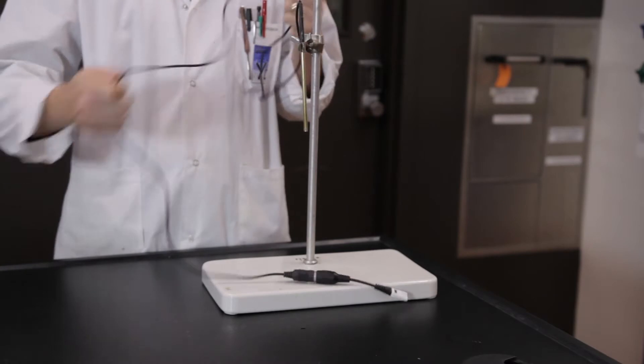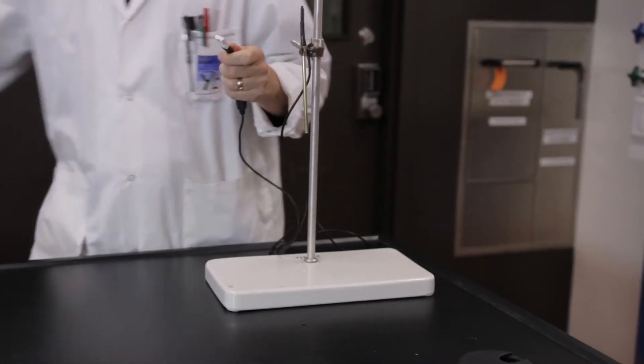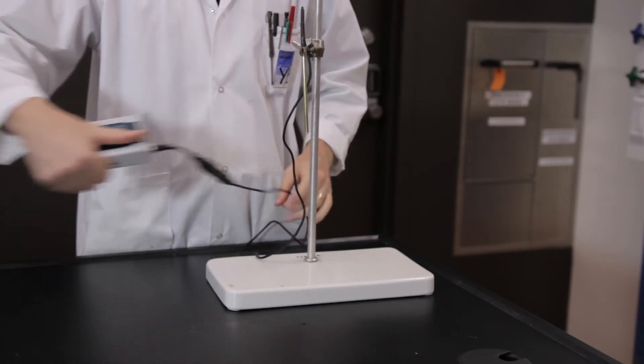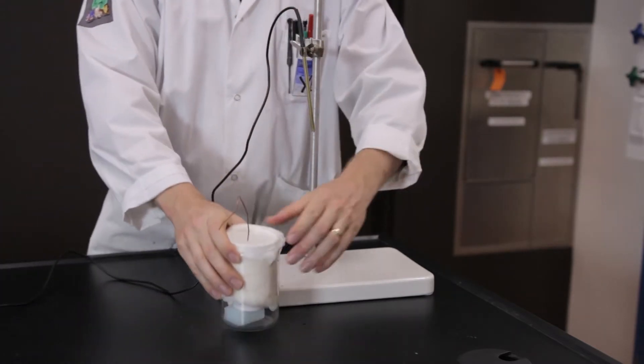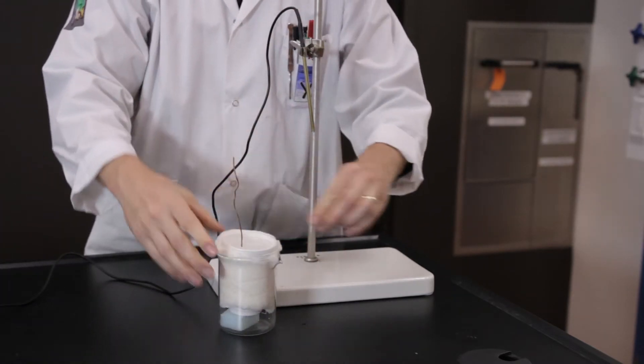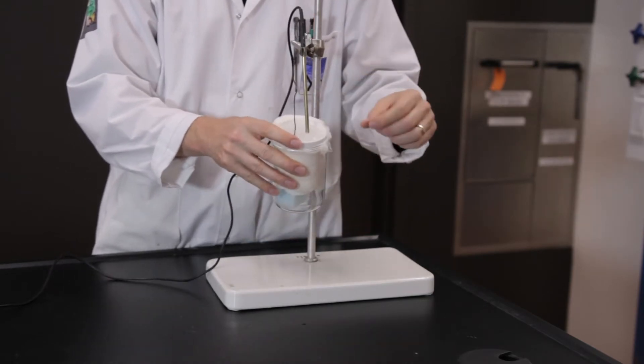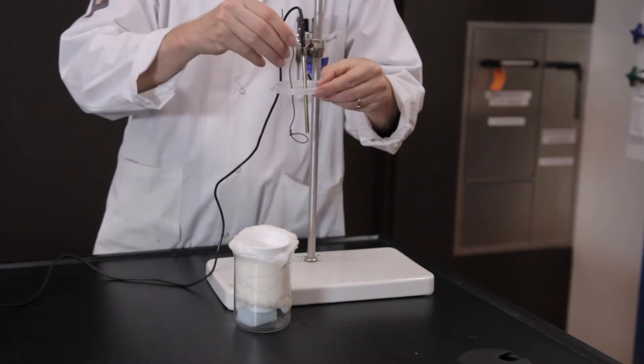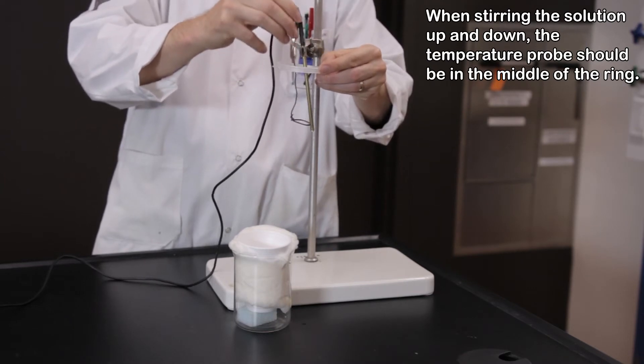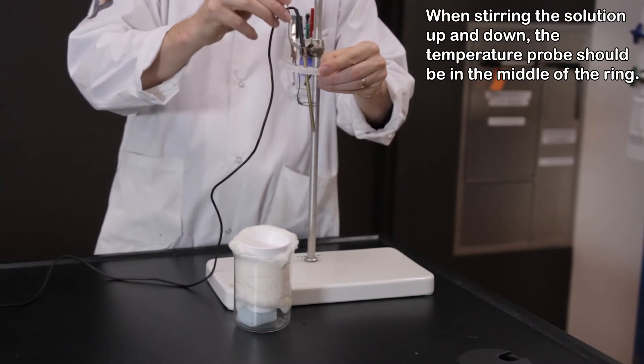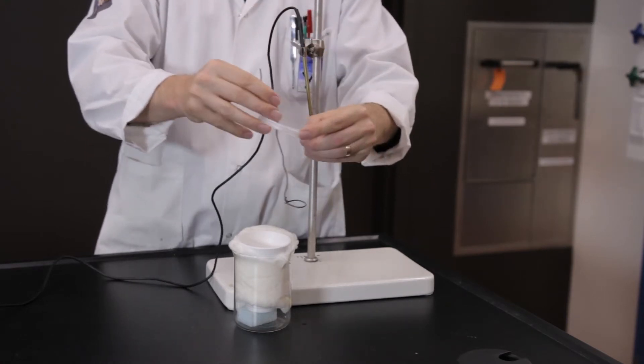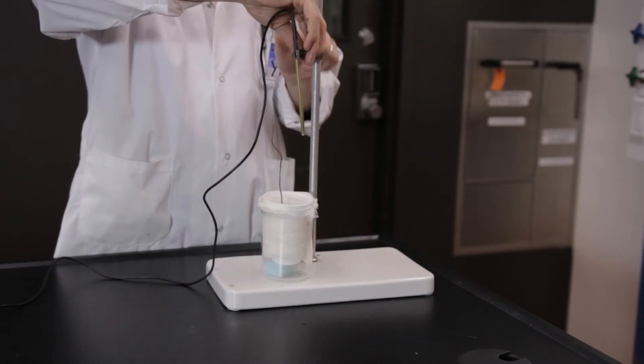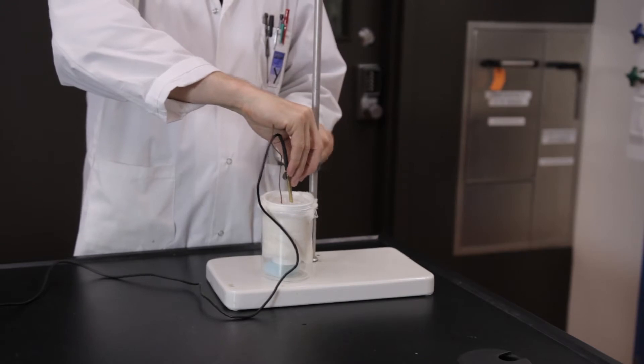Make sure the temperature sensor is connected. Pass the temperature probe through one of the holes in the cover of the calorimeter and make sure to immerse the tip of the probe in the water. Clamp the probe in place.